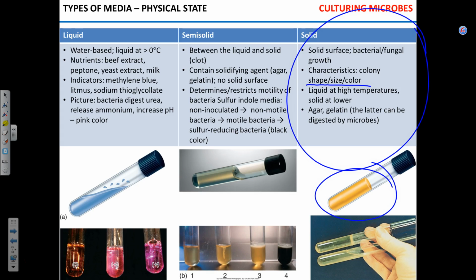I mean, you're not going to see it, but if you want, I can give you a little tour of the prep room. It's pretty boring, even the autoclave is boring. It's like a giant box with a heavy door. That's it. It's like a pressure cooker, just a very, very big pressure cooker. So stick the stuff into it, boil it, sterilize it, take it out.